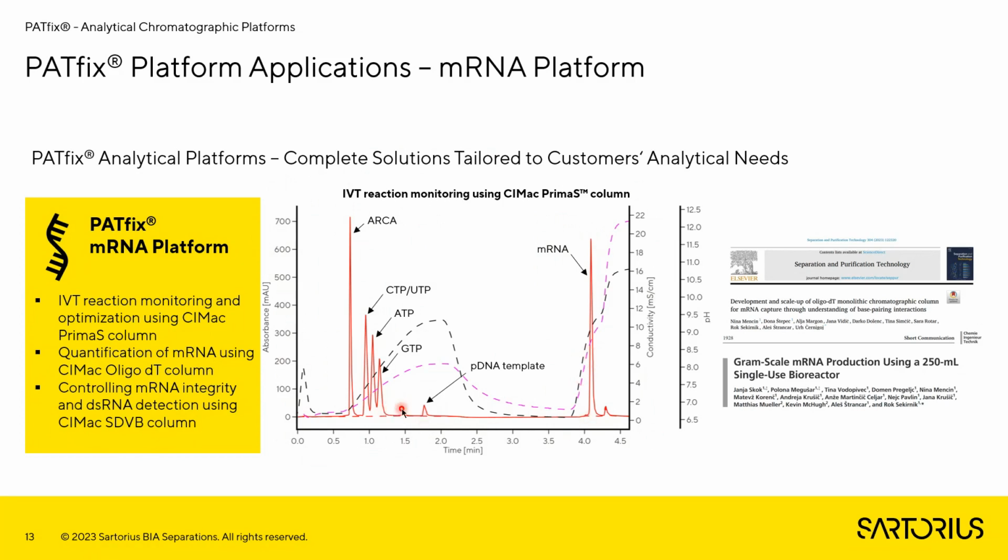So you have the information in around 4 minutes of your IVT reaction.